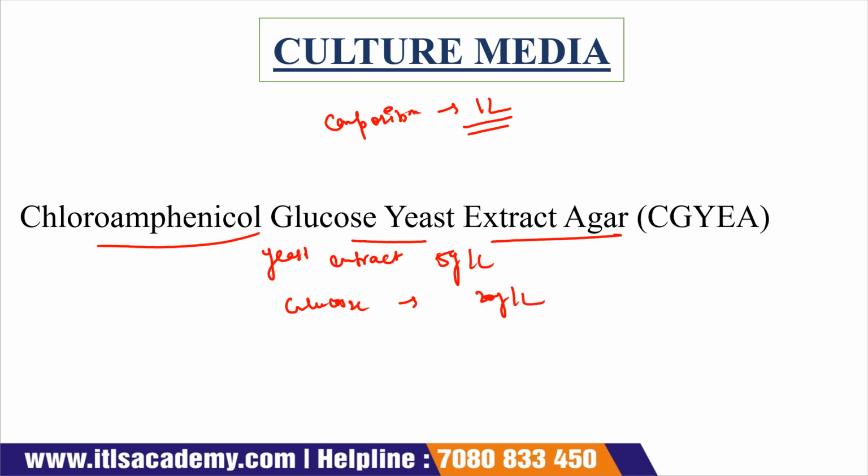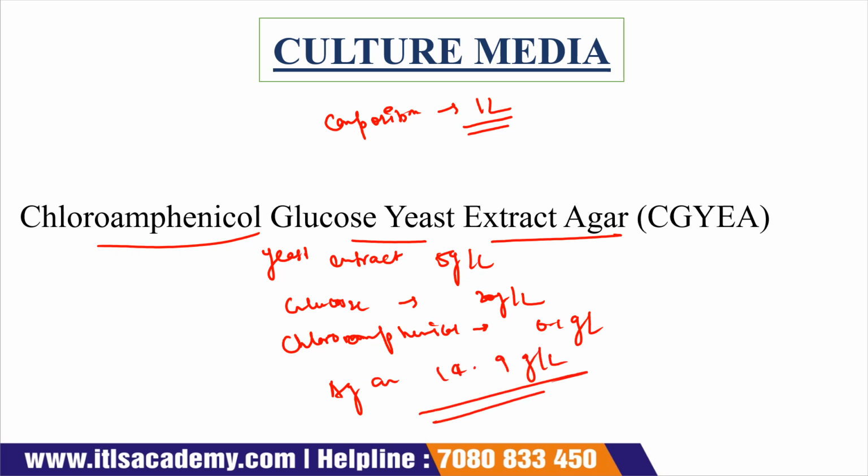And chloramphenicol, we take 0.1 gram per liter, and the last we take agar, 14.9 gram per liter. Okay, so this is the composition for 1 liter.